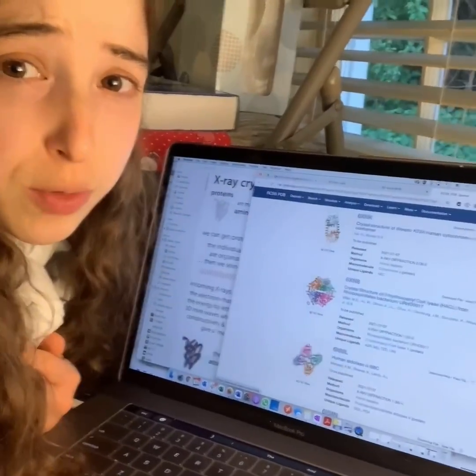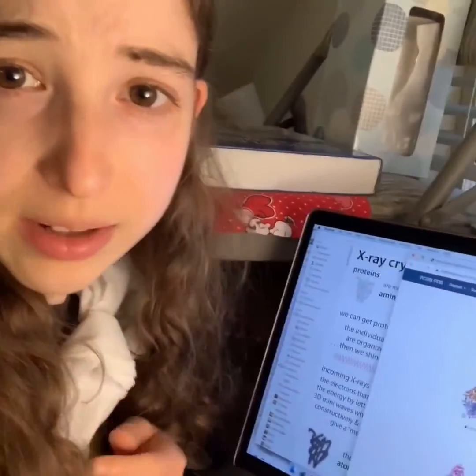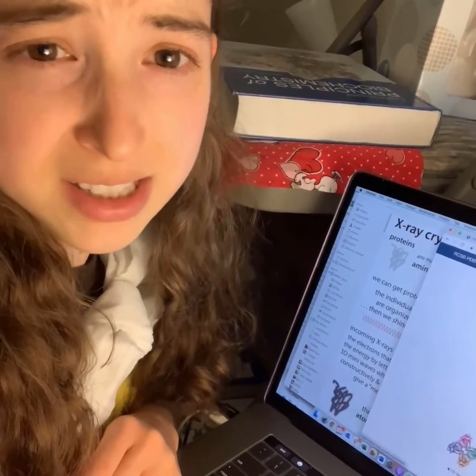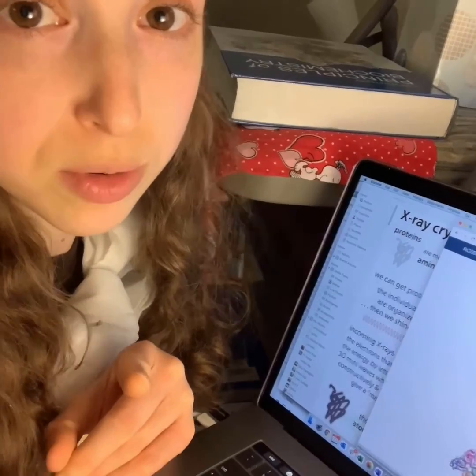Have you ever seen cool pictures of proteins? Things like this, with those cool ribbons and sheets and colors, and wondered how the heck those were determined and how to interpret them? If so, the PDB is your friend, and hopefully this post will help you learn to use it better.